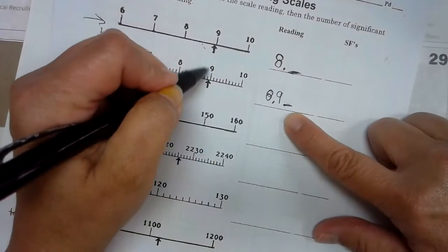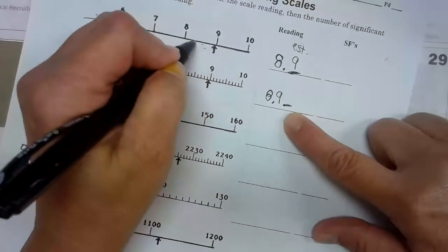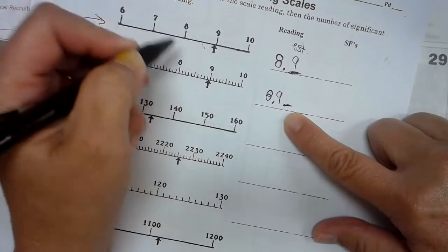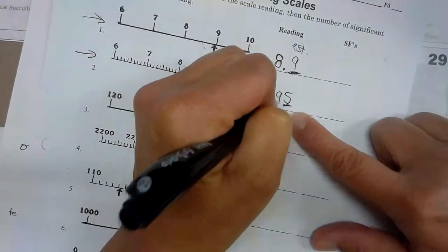Okay, so here, when you do this, you definitely know it's 8.9. This is estimated because you don't have any more divisions, but here you have it. You definitely know it's past the 9, so it's going to be 8.9, and now you estimate in between. It could be a 5, okay?